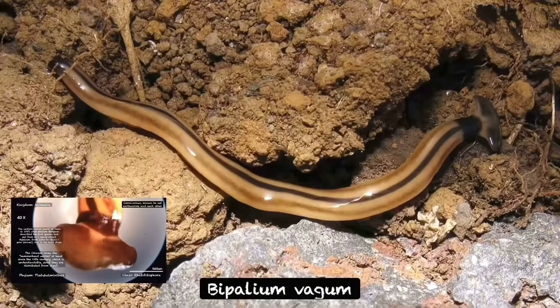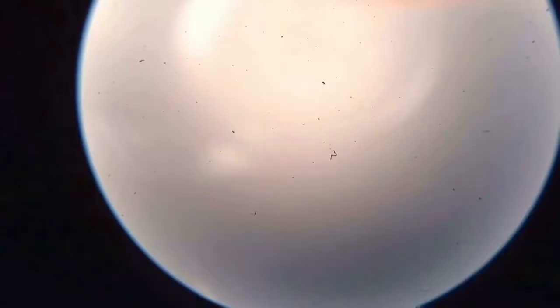Bipallum vagum. These hammerhead worms will follow an earthworm's trail to capture it.